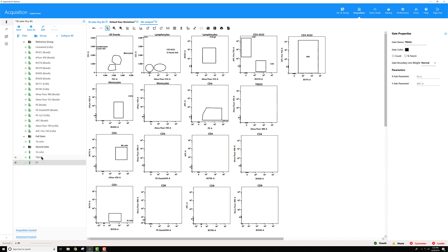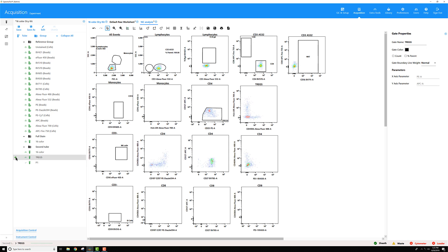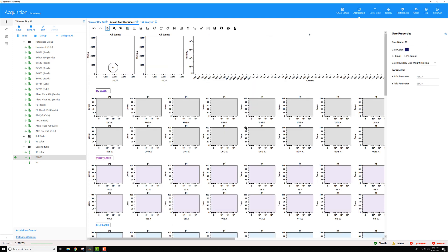The TREG file that I exported, however, you can see it has a different icon in front of it that designates that it's unmixed data. So if I point to that one, I'll see data in the unmixed worksheet. But, since that tube lacks raw data behind it, if I go back to the raw data worksheet, I'm not going to see anything.